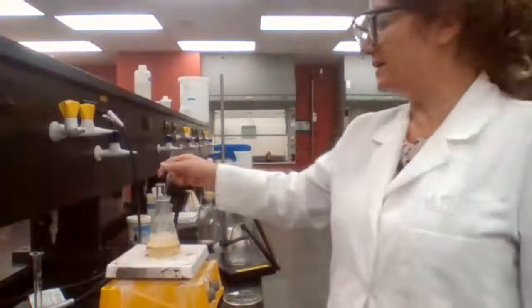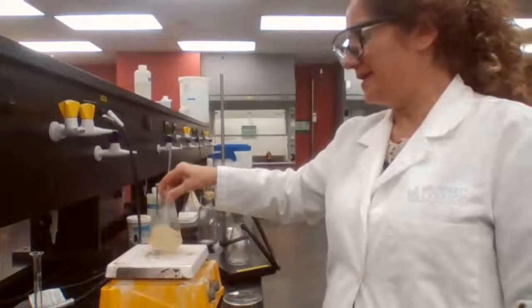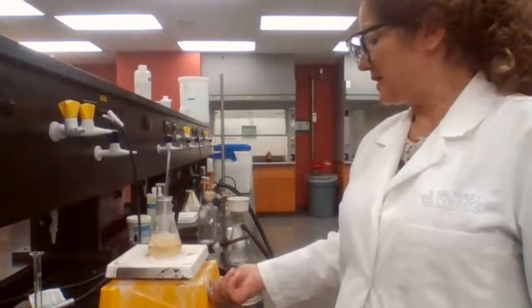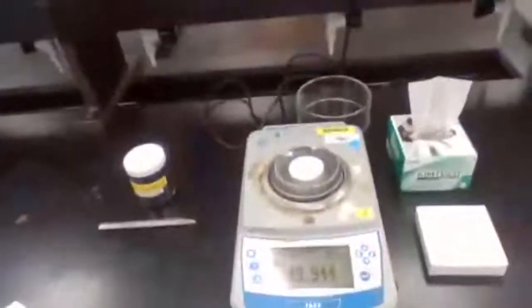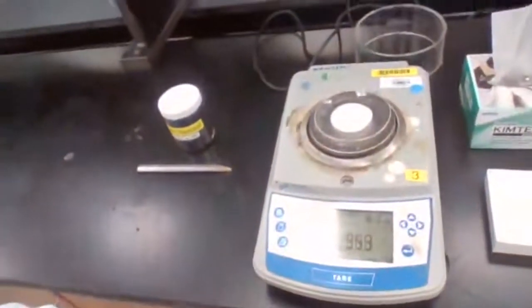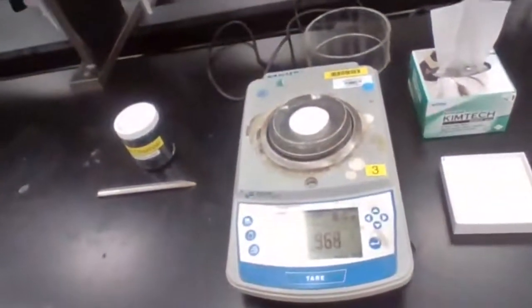Yes. The difference in the number is not going to be huge when it comes to calculation. The balance that they are using is very sensitive, and I can take the camera again there, and I show you how sensitive this is. You see, like I move my hand over, that number is changing. So with a little bit of pressure. Maybe when you took the screenshot, my hand was this much close.